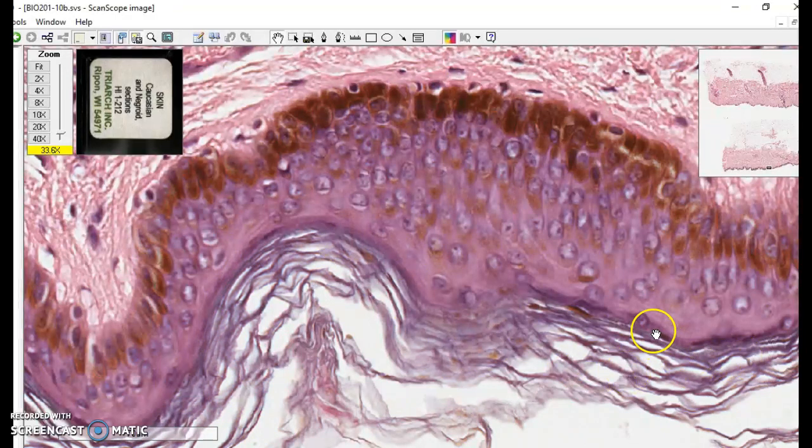This is keratin. This is produced by these cells, and as they move away from the blood supply underneath the basement membrane, they die off. And so what you see are these strands of keratin that would have been around the plasma membrane and are now making these layers of waterproofing material to preserve water in the layers below. So basement membrane, apical side, surface side, and layers of keratin. Again, layers of cells, and this is stratified squamous epithelium.